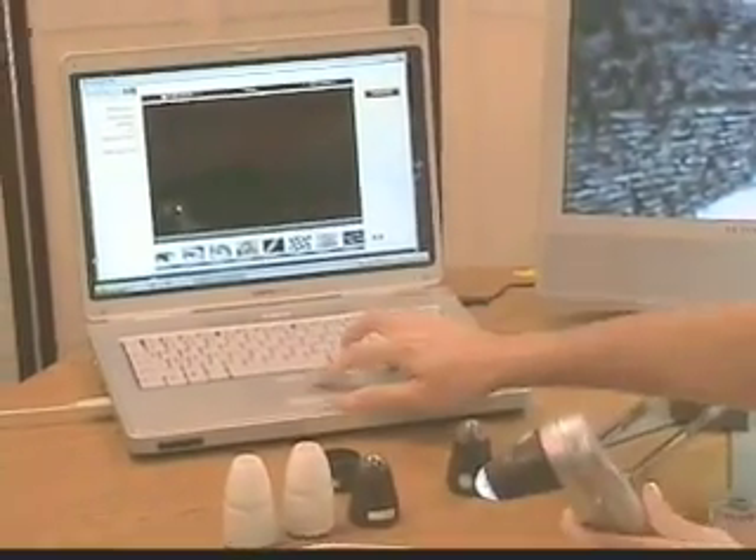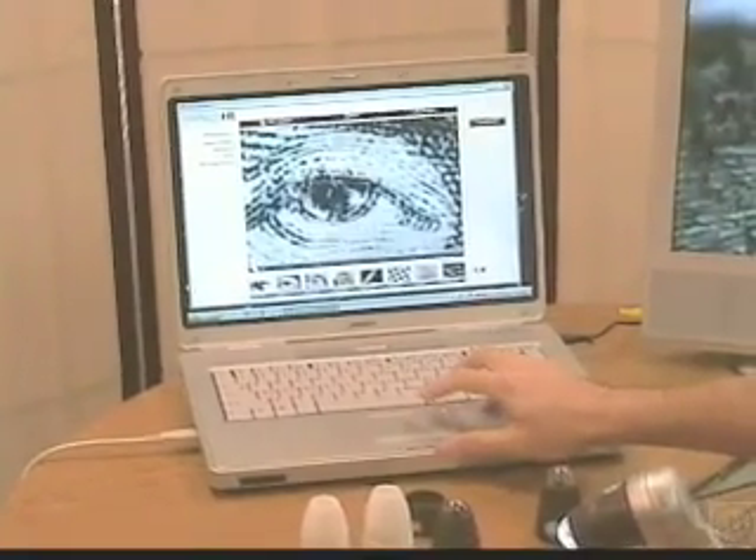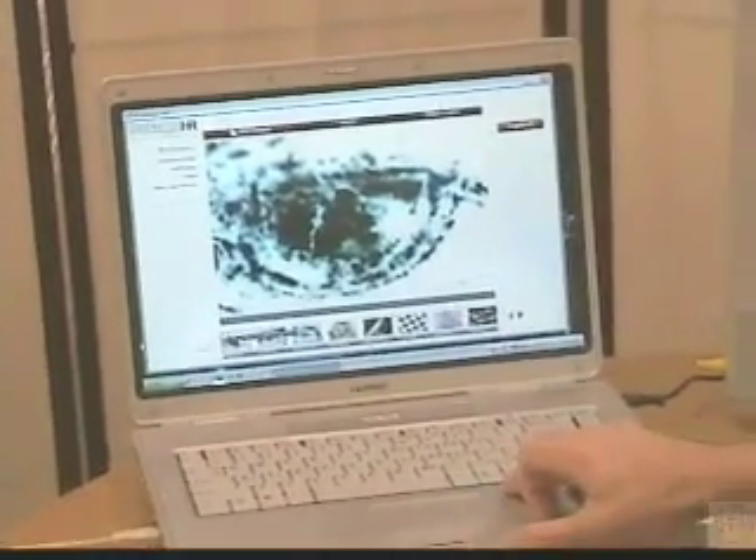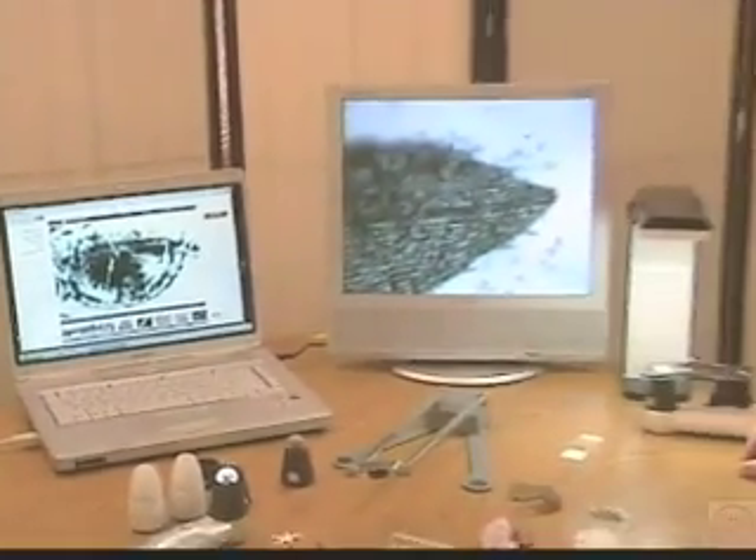So now we can take a look at all those three pictures: there's 50x, 100x, and 200x. I'm going to set the ProScope aside now, and we're going to look at the Scope on a Rope L2.